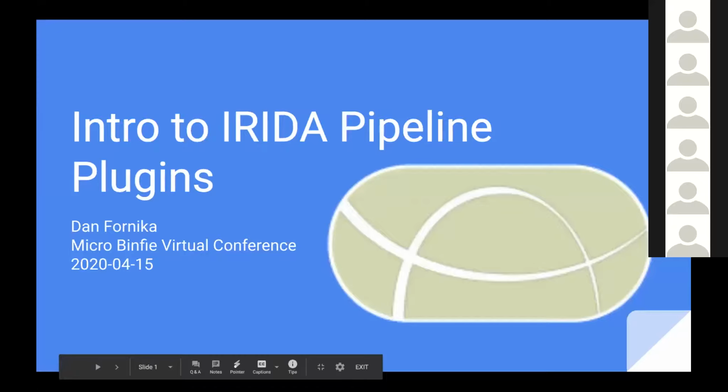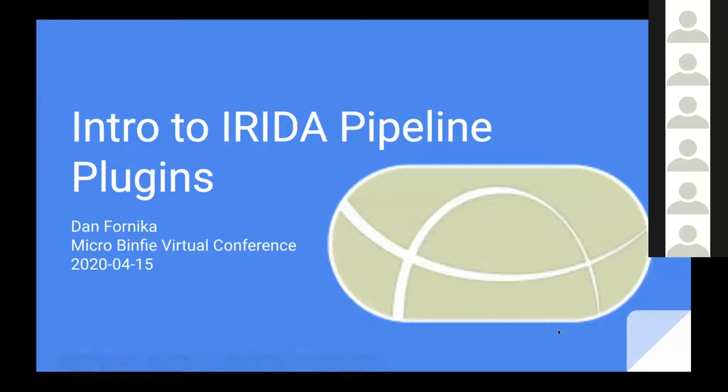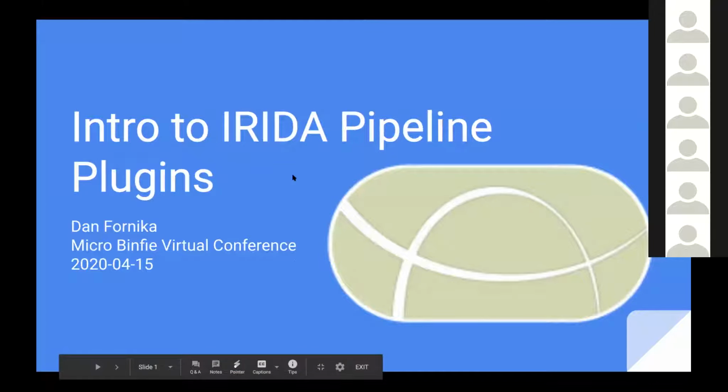First, I'll just briefly correct you, Nabil. Mentalist is a great piece of software, but I'm not the primary author of the software itself. There's a fellow named Pedro, who is a postdoc who wrote most of the code and the algorithm, and I played a supporting role in helping to maintain the software and help the GitHub repo to stay in good shape and make releases and that sort of thing. My apologies. But Mentalist is definitely a great, fast way of doing core genome MLST.